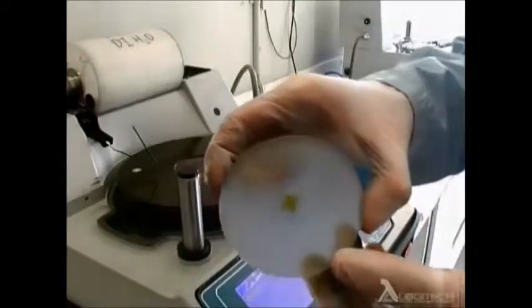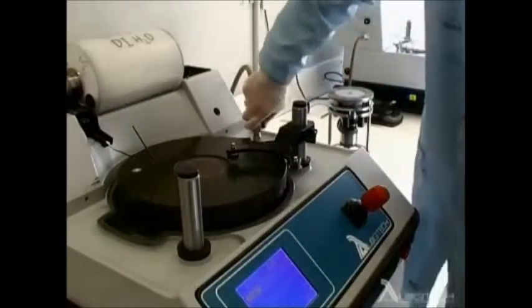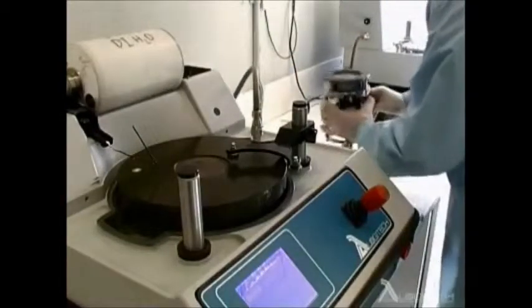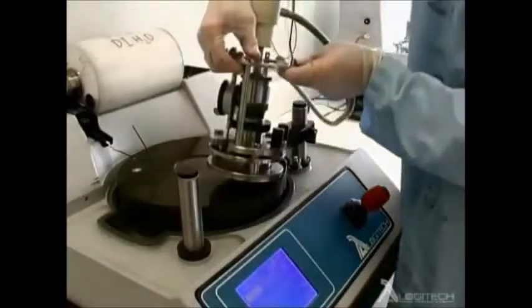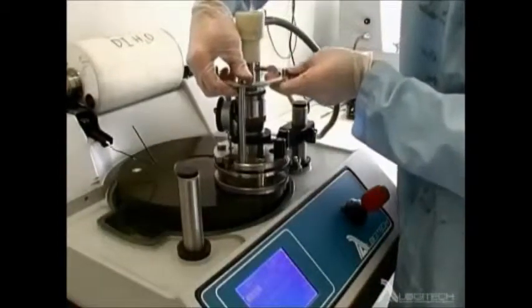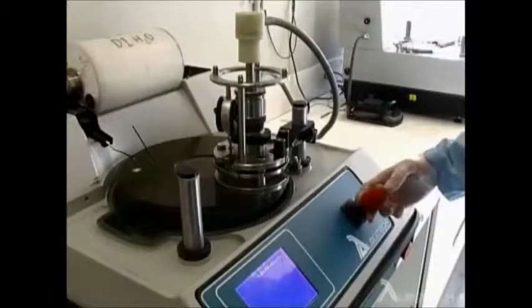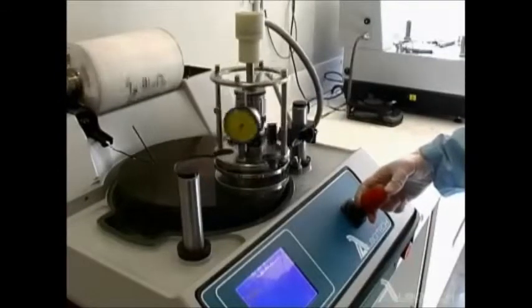The bonded sample is attached to the Logitech PP5 Precision Lapping and Polishing Jig, which accepts samples up to 3 inches in diameter. The jig allows precise control of the orientation of the specimen to the polishing plane and fine adjustment of the load applied during processing. The load is variable from 0 to 2800 grams, which is enough to accommodate materials covering a wide range of hardness, toughness, and sizing.